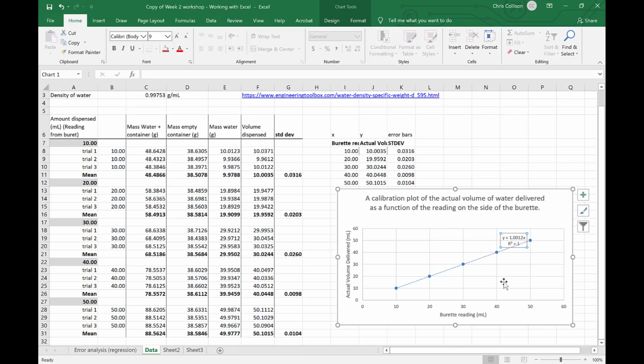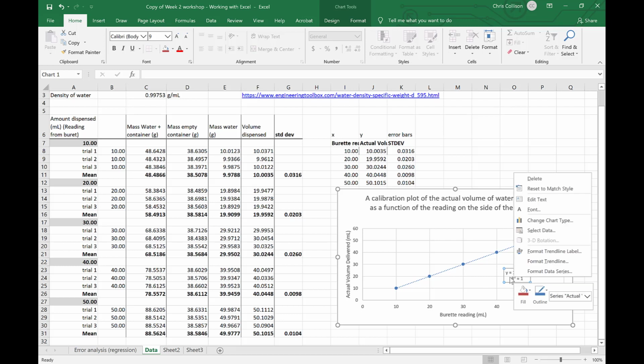close the window, and now let's have a look and see what we've got in here. We've got a legend now, and our legend in this case has no intercept because the intercept is in fact 0. But the other thing we need to be able to do in here is change the numbers in that legend.